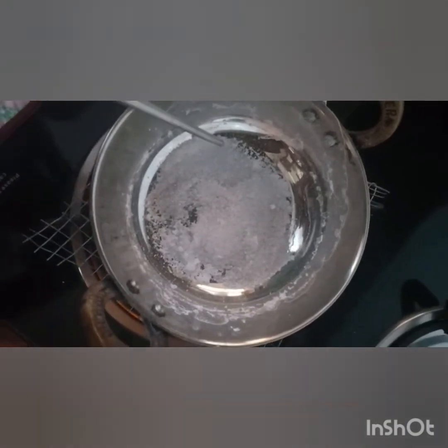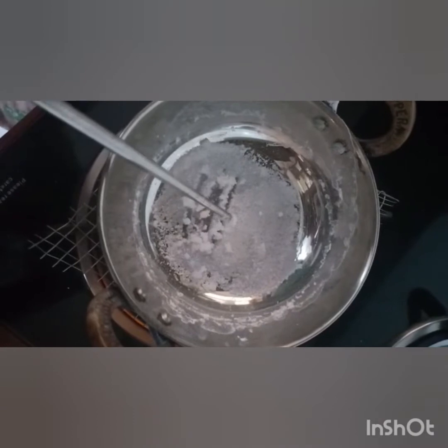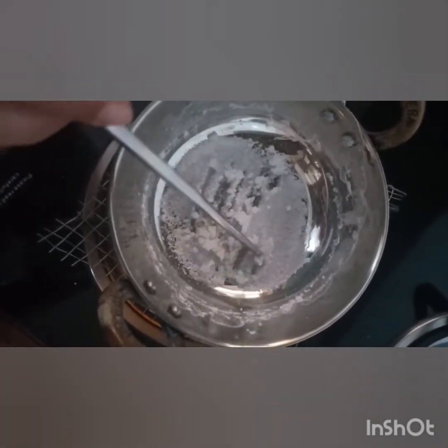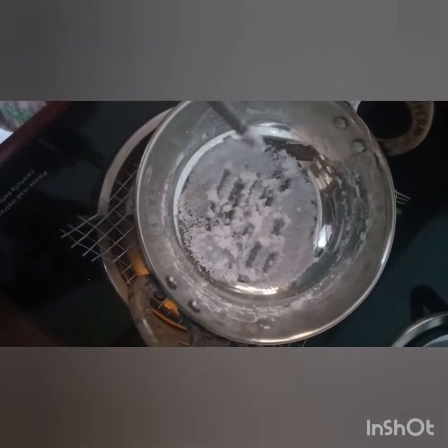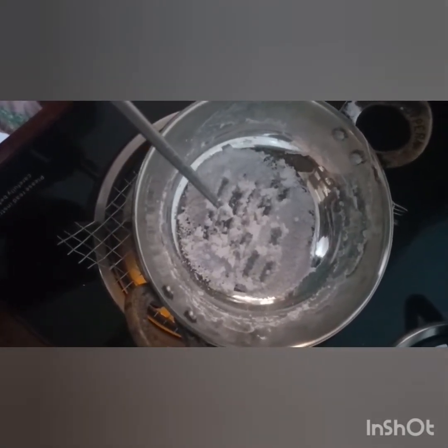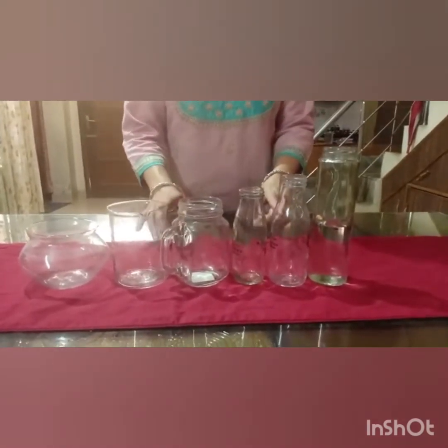See children, the water has evaporated and the salt deposits are here in the evaporating dish. So this is how salt is separated from its solution. Thank you children. Now I am going to show you experiment number 2.